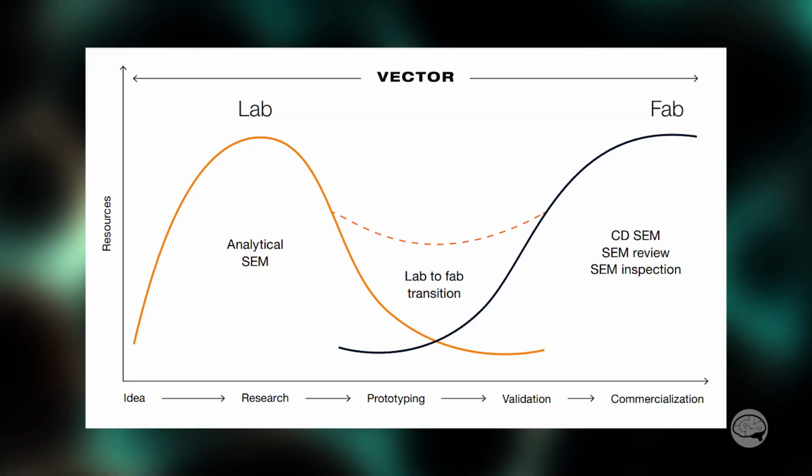So it's kind of like a CD-SEM, but tell me it doesn't cost $10 million like a CD-SEM does. That's correct. It's much closer to a conventional analytical SEM in terms of cost. So this is mainly for the semiconductor industry or other industrial applications? Yeah. Semiconductor is the first one you would think of, but of course we are adaptable to R&D environments. We have multi-sample holders, so you can put small piece parts of any type, or small volume manufacturing. If you have a certain number of parts and can't afford a large CD-SEM, then maybe this is a good solution in that kind of environment as well.